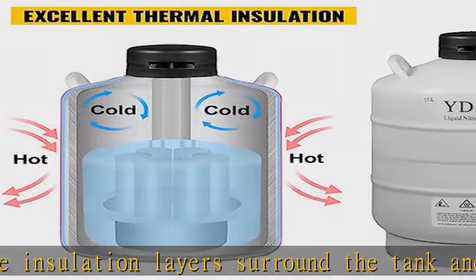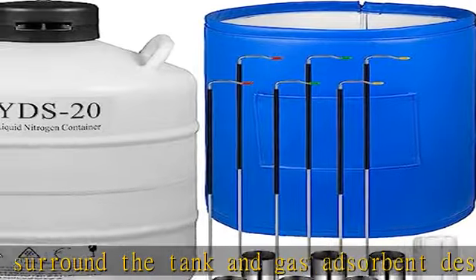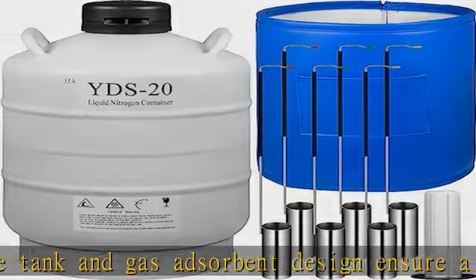Wide applications: the liquid nitrogen tank is widely used to store semen, embryos, cells, dry ice, metal materials, and others in lab, medical, farm, beauty, and more settings.